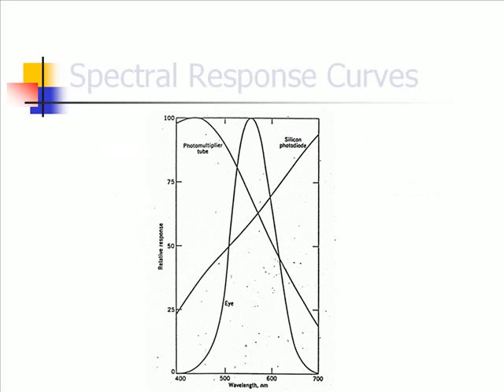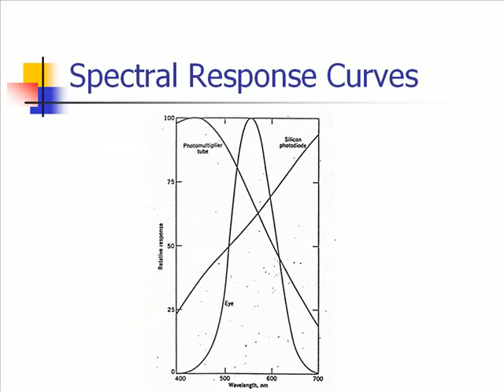The other two, silicon photodiode and the photomultiplier tube, are completely different from our eye's response, but both of them have response in all wavelengths in the visible range, so then we can use them and manipulate things mathematically. Models how our eye sees it. Again, it doesn't do it exactly the same. We have to model it somehow, and whenever we do that, we have some type of error involved in it. Maybe a little bit, maybe a lot. It just depends on our model.